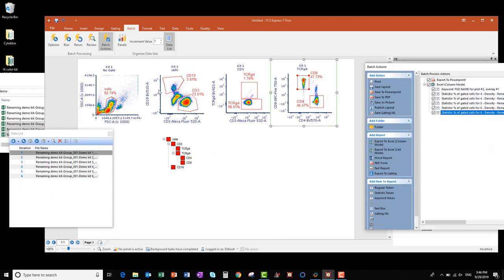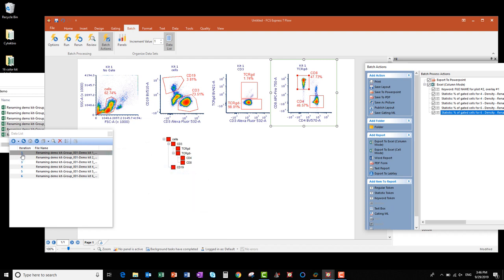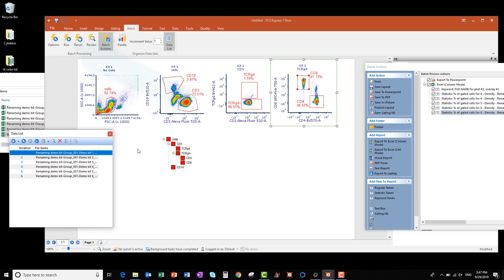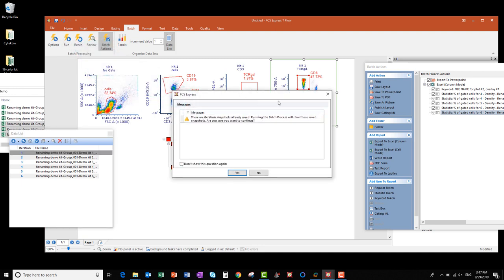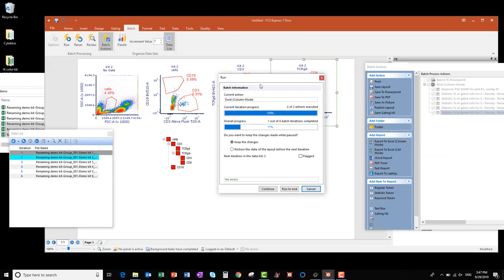Before starting the batch process, make sure you are happy with the gate locations for the first file, because you don't get to reposition the gates for the first file in your data list — only for the subsequent ones. Also, make sure iteration 1 is selected in the data list to ensure that your batch process starts at the top of the list. If a different iteration is selected, like iteration 2, the batch process will begin at 2 and run through 6. Next, I'll click the Run button to begin the batch analysis. In the window that appears, click Yes.